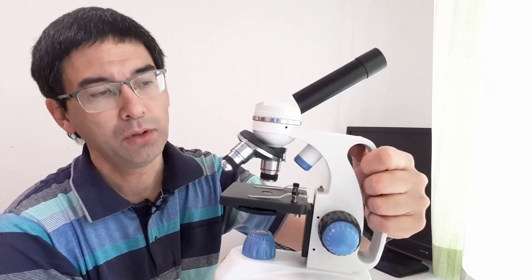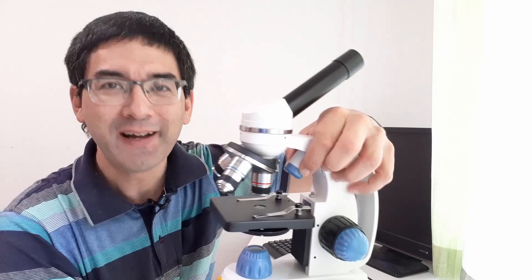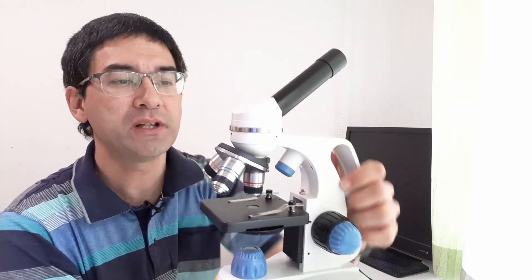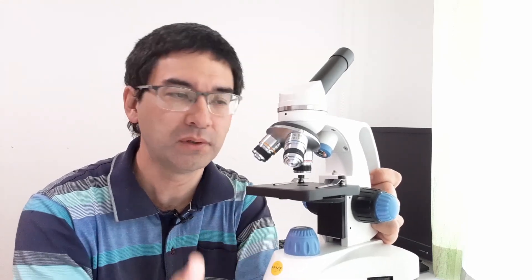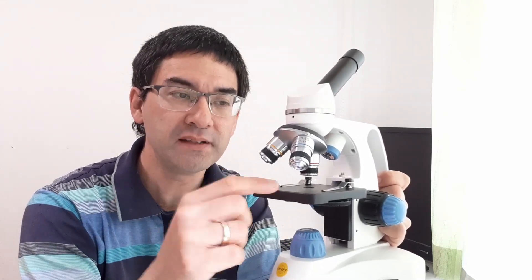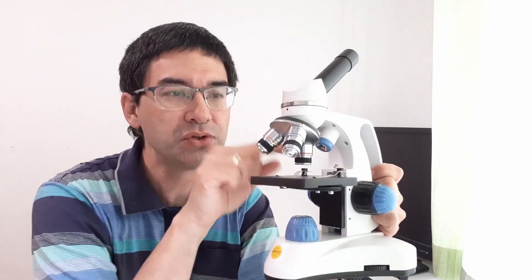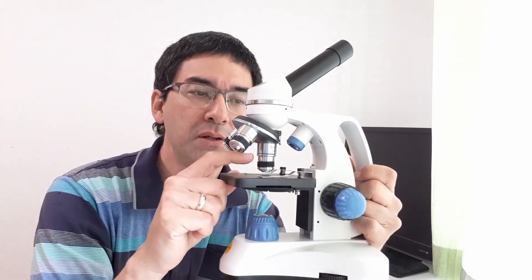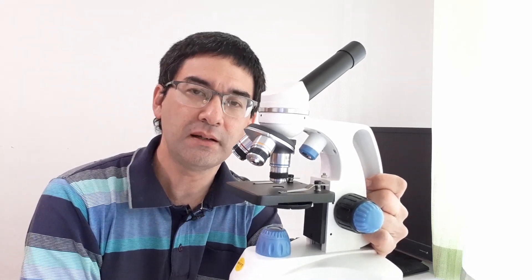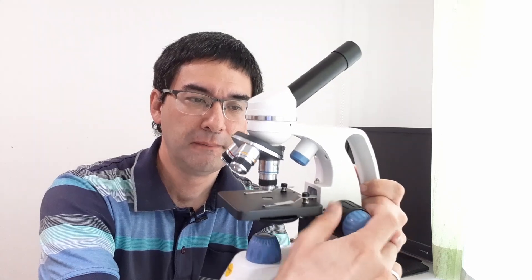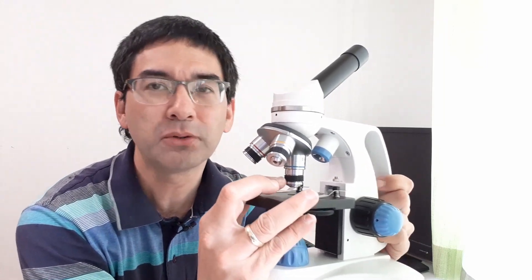One thing that is a little bit unusual is that there is also a lamp from the top. That's not a disadvantage and it allows you to see objects with the low power objective, this is the four times magnifying objective. They can also be seen from the top, so if you've got a small insect or other smaller objects and you place it on the stage, then you can also see how it looks from the outside. It's not designed to be used with the high magnification, that's the 40 times, because the objective itself is going to make a shadow.